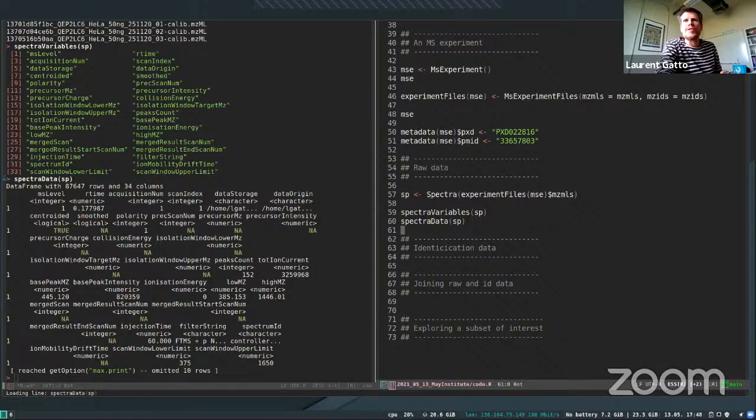So what kind of results am I trying to reproduce? I'm not trying to reproduce anything specific from that data. I'm going to show how to load data, how to do some quality controls and visualization of the data. I'm not trying to replicate anything specific.